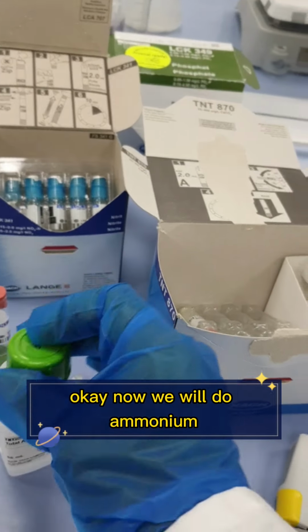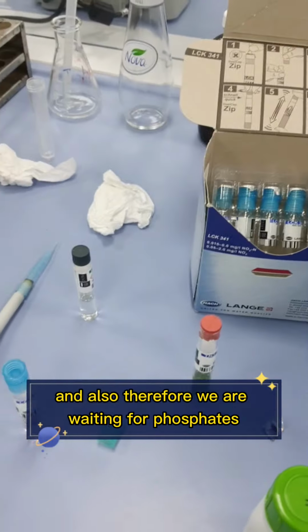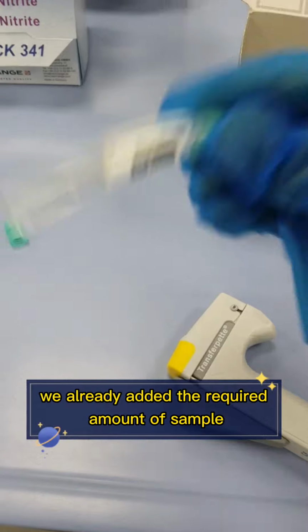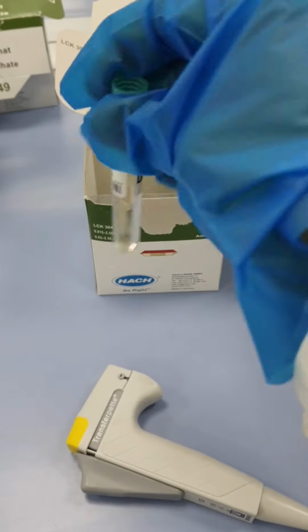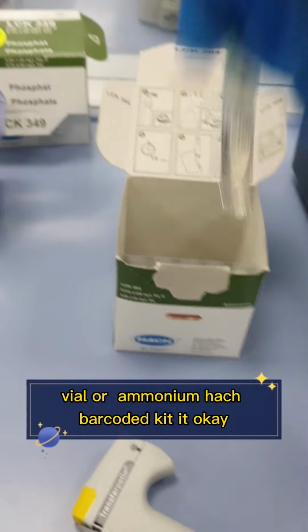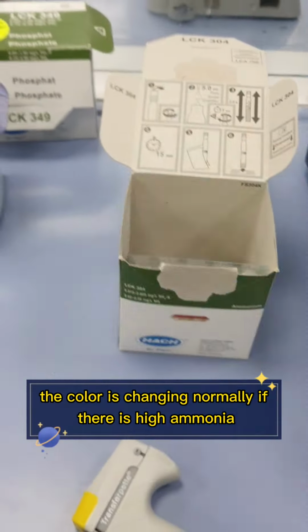Now we will do ammonium, and also we are waiting for phosphates. Now you can see here we already added the required amount of sample in the ammonium vial or ammonium Hach barcoded kits. So you can see here the color is changing. Normally if there is high ammonia, the color will be dark green.